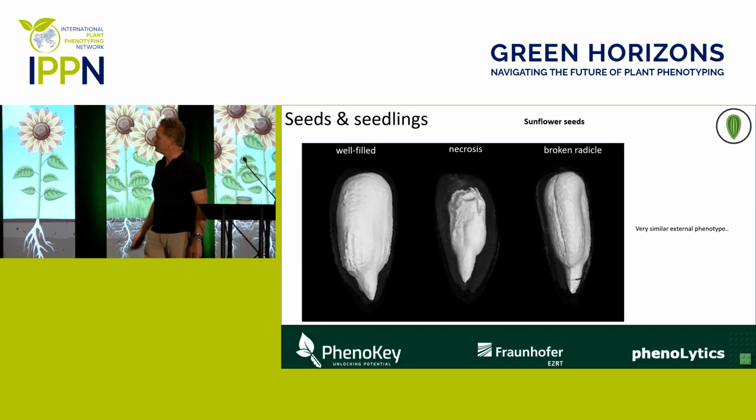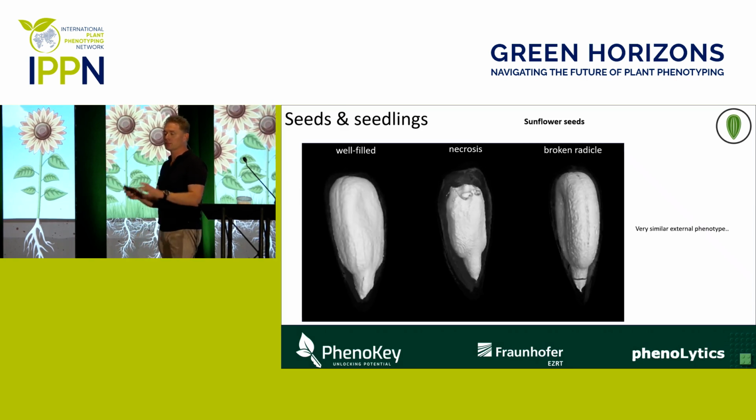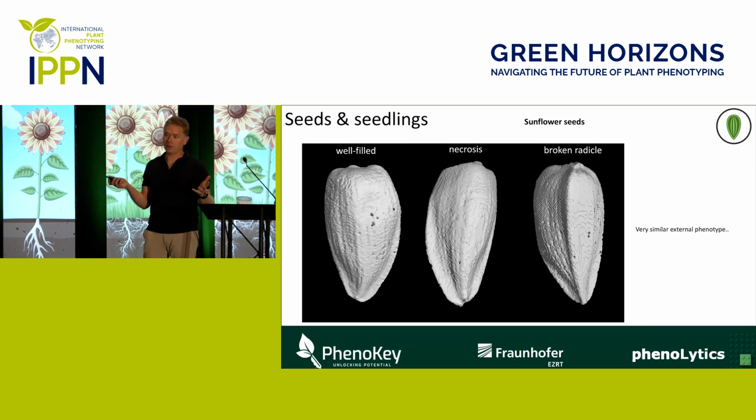A nice example here. Here you see 3 sunflower seeds. On the outside, they have exactly the same phenotype, essentially. But if you then peel it down and look on the inside, then you see 3 completely different seeds.